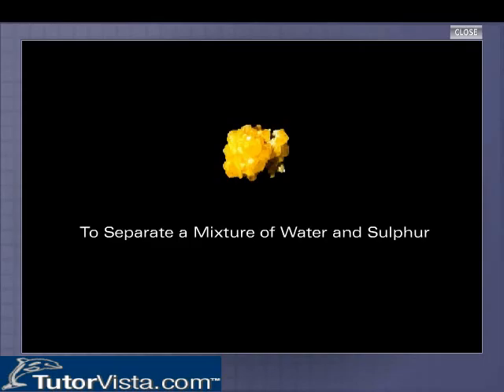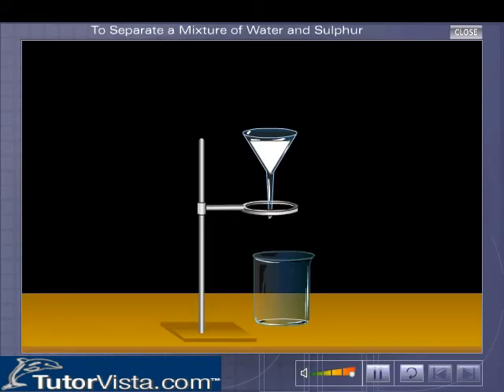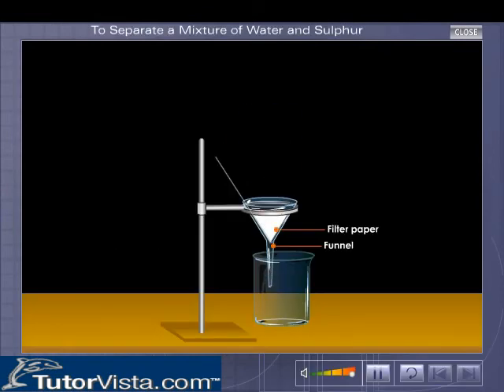To separate a mixture of water and sulphur, place the funnel containing the filter paper cone in a funnel stand with a beaker below.